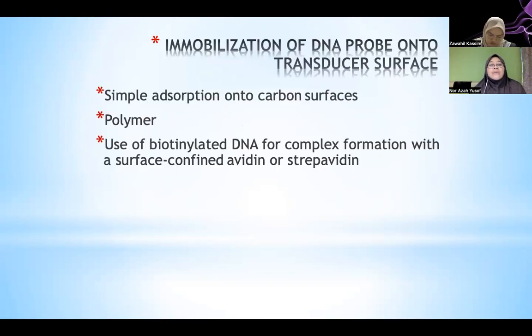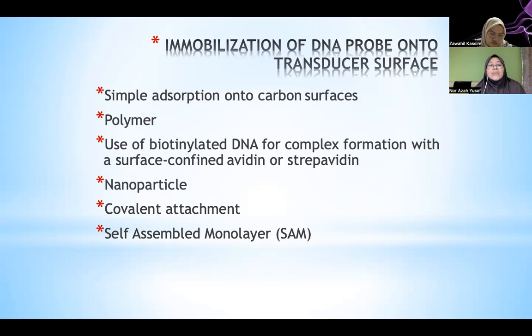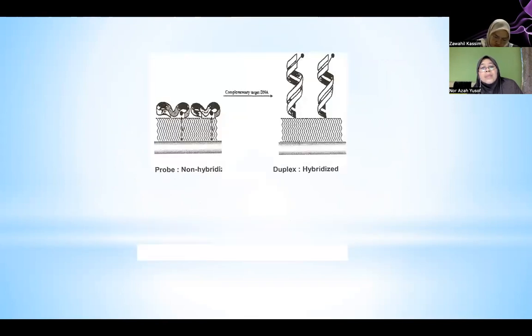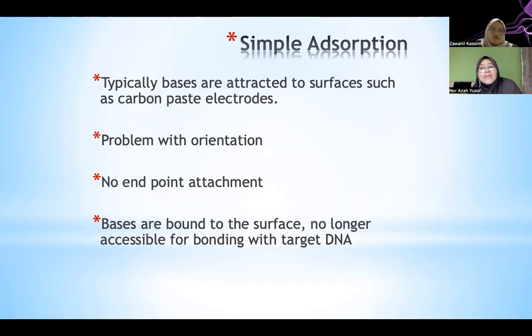So I'm starting with a very simple method of immobilization. Even though it is simple, it's not really practical, but we still discuss it for the purpose of understanding. We start with simple adsorption. For example, a lot of sensors, especially electrochemical and optical sensors, use carbon electrodes, because carbon is cheap. This is what happens if you choose simple adsorption. Of course, it is simple: you just incubate, which means you dip the sensor in the DNA probe solution, and the probes attach themselves to the sensor surface.